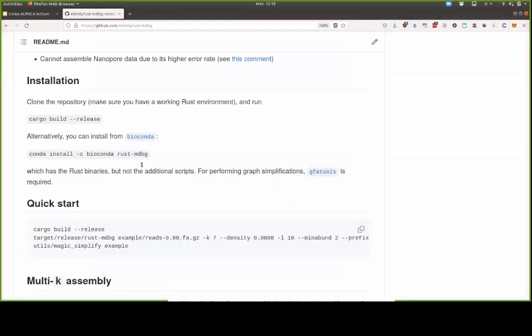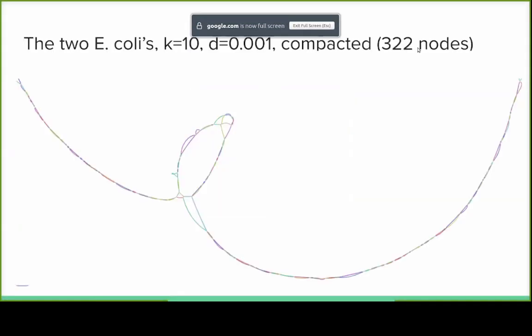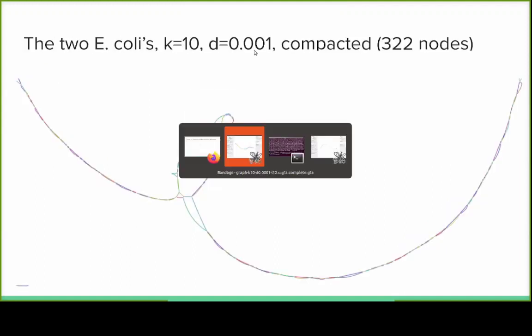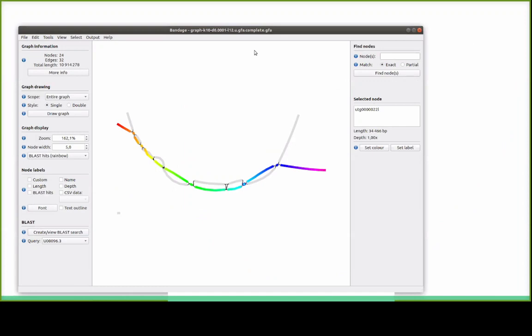So yeah, that's all I wanted to show for these two genomes. What else do I have? That was with a different set of parameters, with 10 times bigger density, a bigger graph, but still relatively small. Sorry, if you go back, one more, please. This is the only slide. One back, I think, the one where you were, oh, sorry, on Bandage.